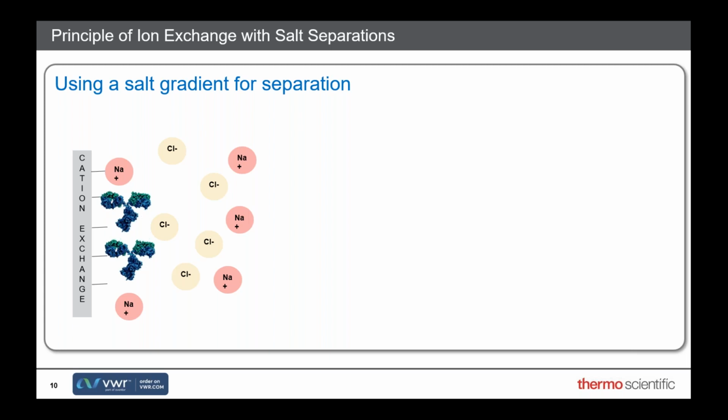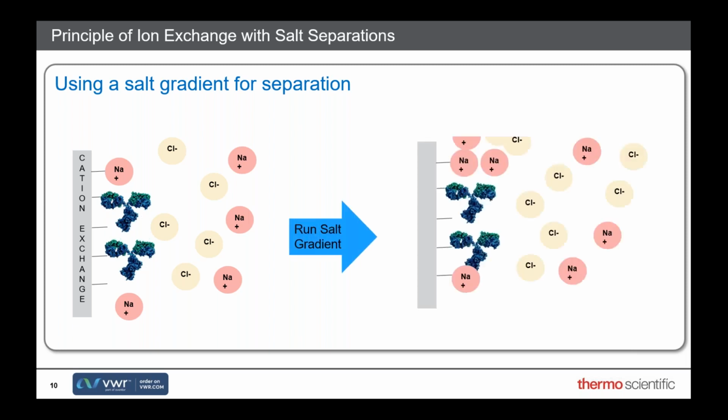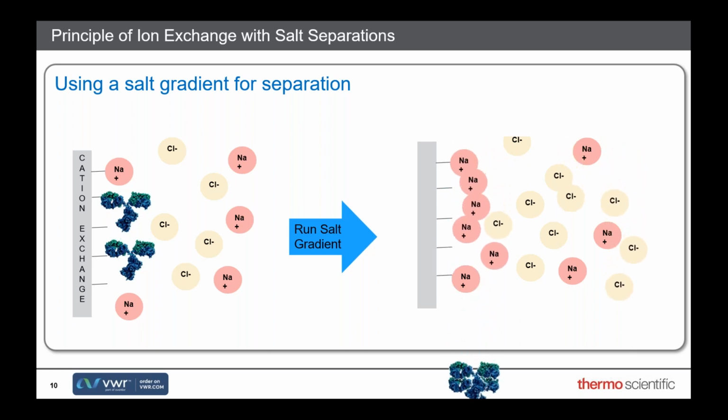Whether using a cation or anion exchange column, sodium chloride can elute the bound protein. In anion exchange, chloride is the counterion. Chloride is exchanged for the target protein, which of course is then released. In cation application, as shown on screen here, the counterion is sodium because the sodium cation is exchanged for the target protein. So you see a very small animation on screen there, and in that animation you saw the sodium cations preferentially bind to the resin and thereby cause the proteins to elute.